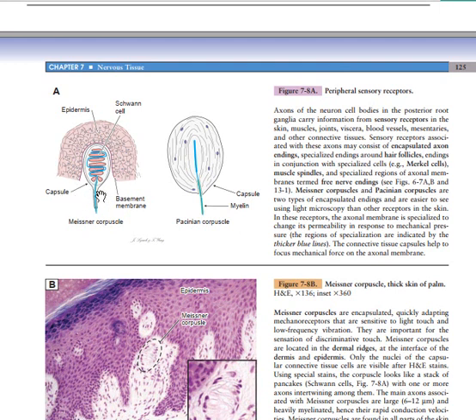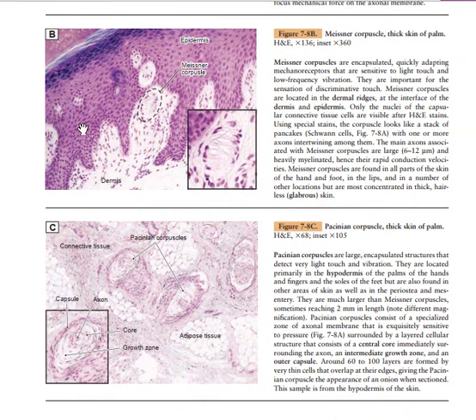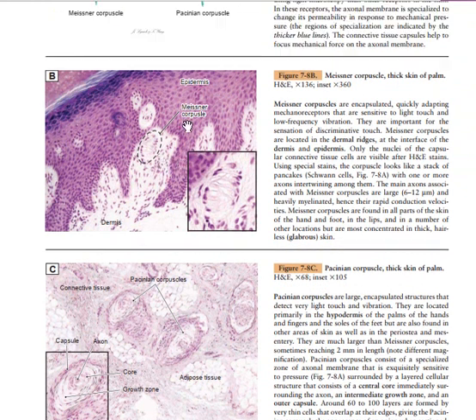You visualize a capsule above, and it is beneath the epidermis of the skin, usually the epidermis of the palms of the hand. So we have a capsule above, and then this is a Meissner corpuscle. While for the Pacinian you have a capsule, and then you have myelin sheath with nerve. Here the nerves are entwisted, as you can see, while the nerve is just straight with the capsule. So the Meissner corpuscle, this is a histological representation. We have a capsule here, and you have the nerve ending. Actually, it is trying to intertwine, as you can see here.